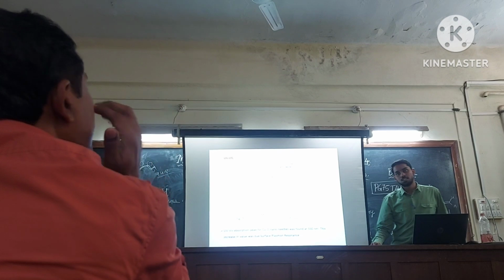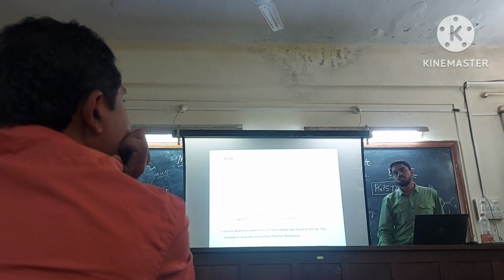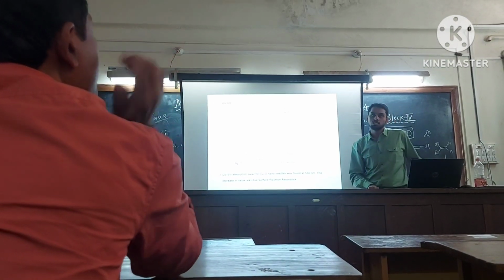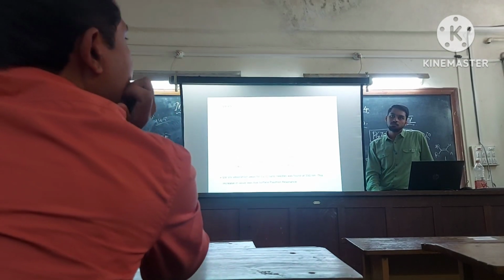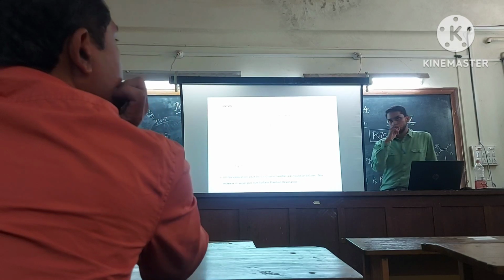Now in the structure there are no such organic molecules to show such kind of absorption. Other than organic molecules, if we have such kind of absorption at more than like 500, those are better, which you can use now for materials like OLED. If we calculate the band gap of that one.